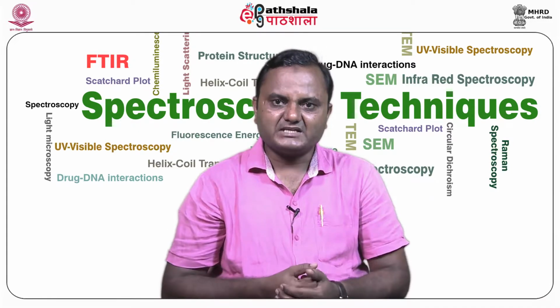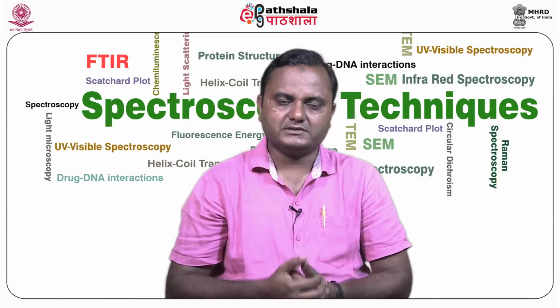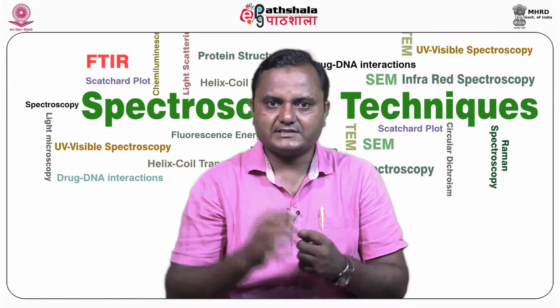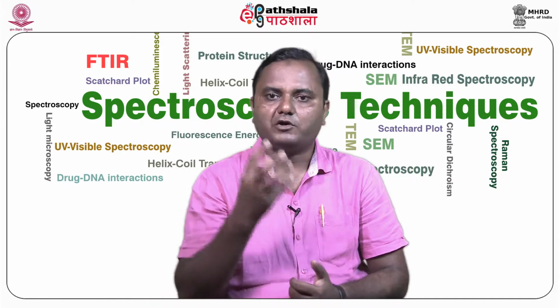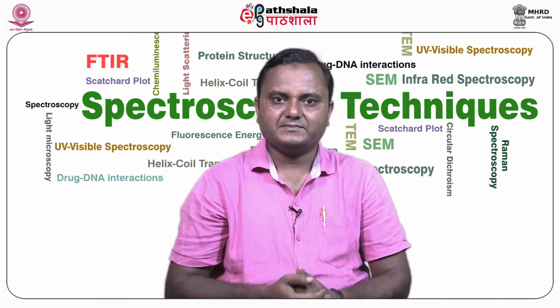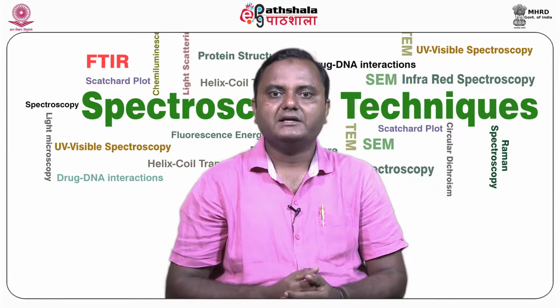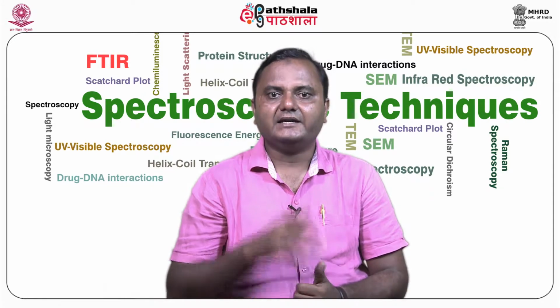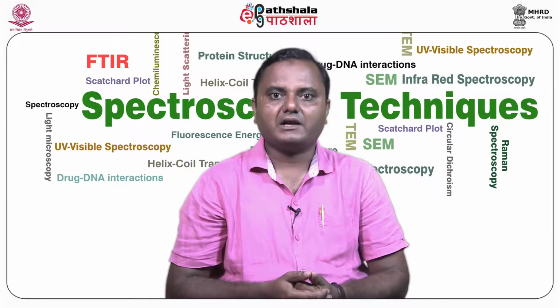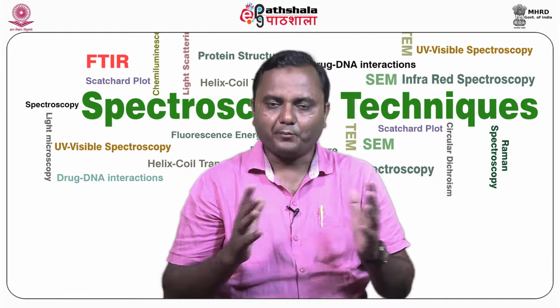In this system, the principle applies to the measurement of molecular weight for any molecules, as the dedicated LALS detector can have a small flow cell since it has only a small volume to accommodate for the one measurement angle. Overall, LALS measurement offers an accurate way to measure molecular weight using static light scattering. LALS is particularly useful for measuring the molecular weight of large anisotropic scatterers such as synthetic and natural polymers.